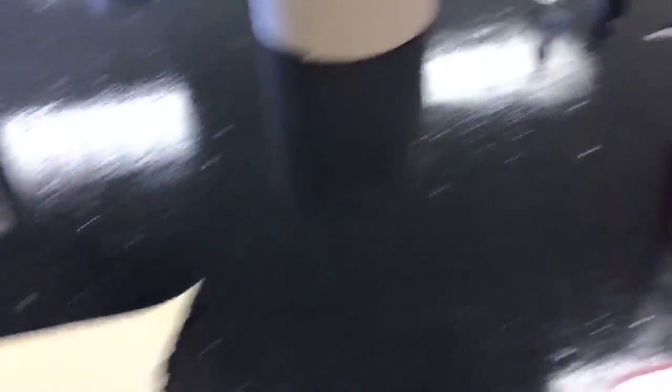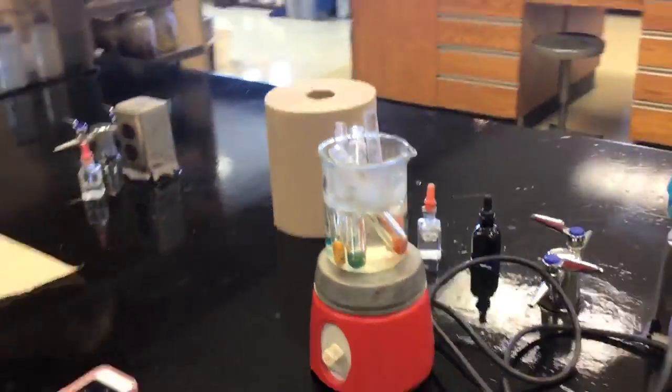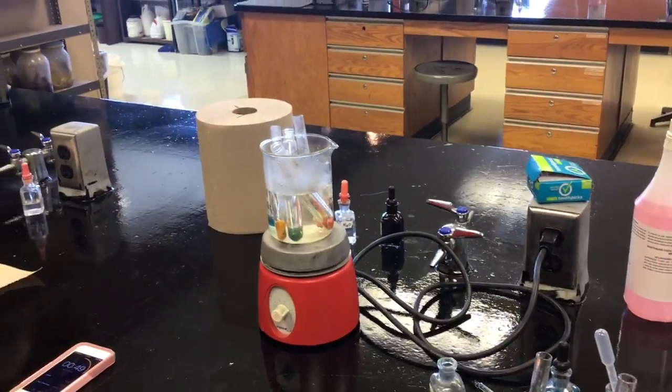Counting down to about a minute now. It's in there cooking. I'm going to grab another test tube rack so I can put the results in a separate rack.